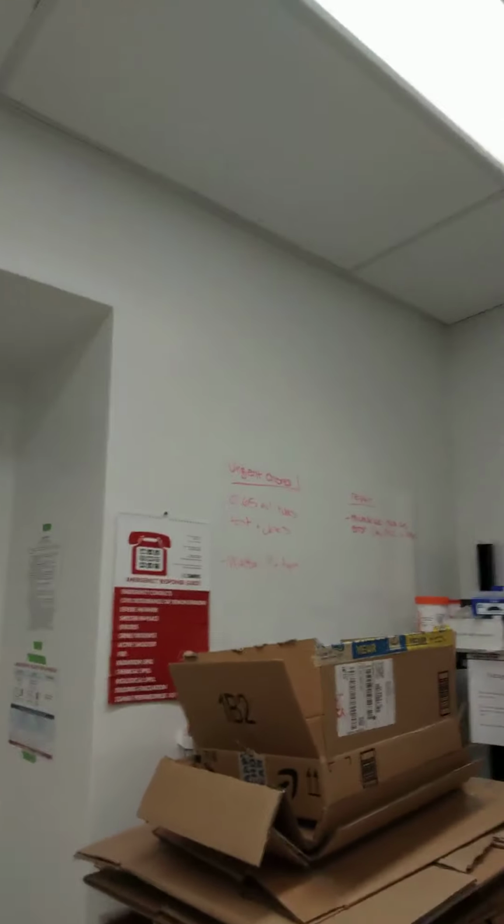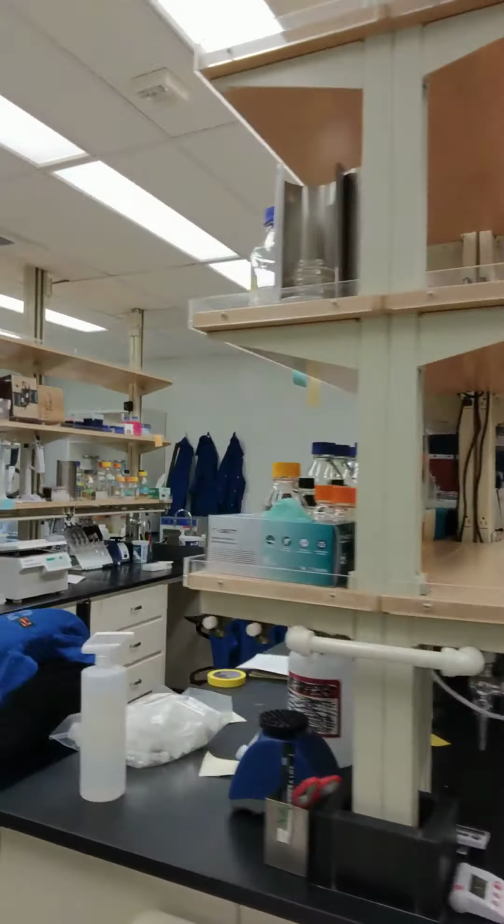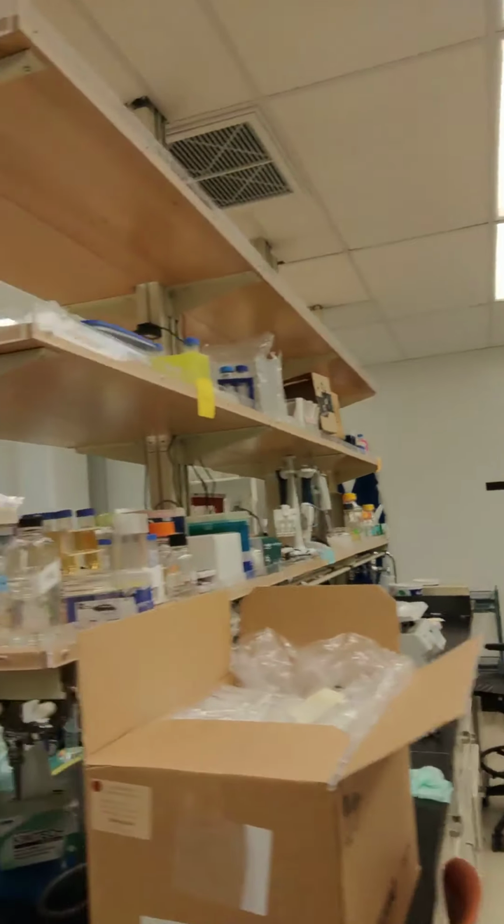I'm going to give a short introduction to our lab, and I first want to start with introducing our physical space, because as a new assistant professor, the newest lab in the department, this is something that we've been putting together over the pandemic. So we're really proud of how many boxes we've unpacked, and how organized we have gotten the space. We've got room for 6 full-time workers, but currently don't have that many people hired.